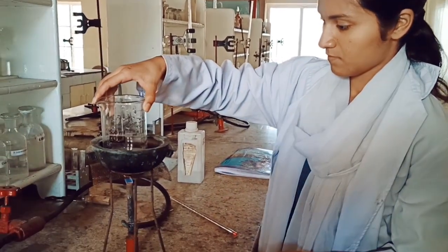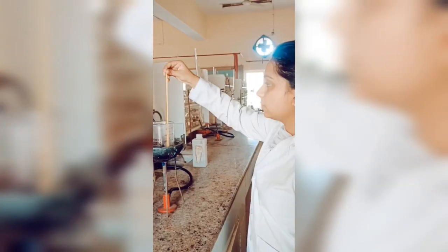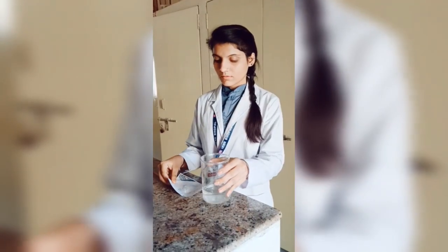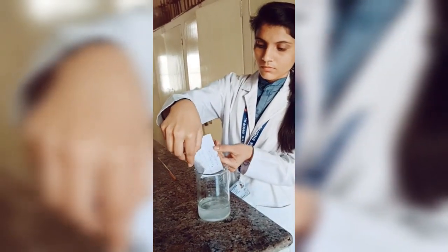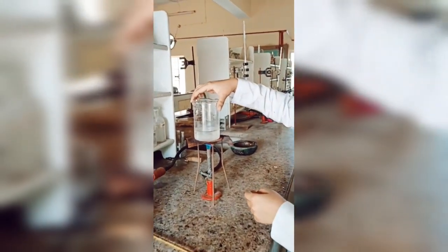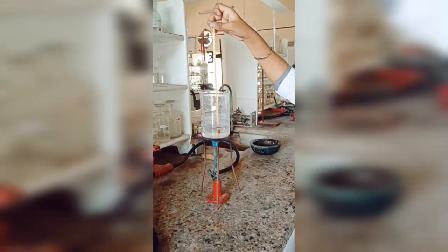To measure the boiling point of water, place the beaker containing water in a water bath and heat it. Heat until the water is about to boil. Record and note the temperature. Then weigh 40 gram of salt using a weighing machine. Add the weighed salt into 60 gram of water. Heat this solution until it starts to boil. Then record and note the temperature.